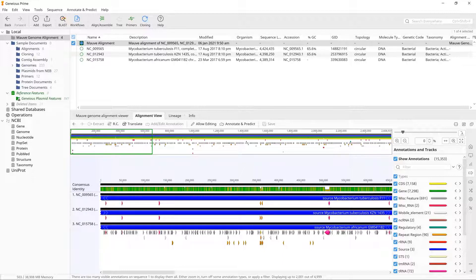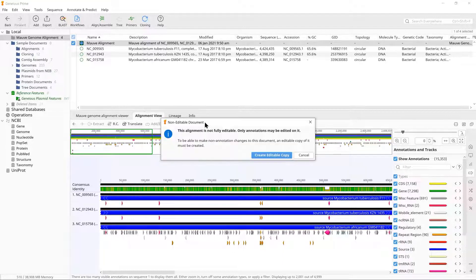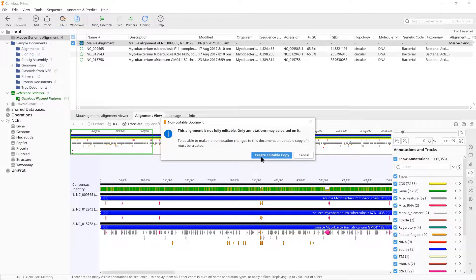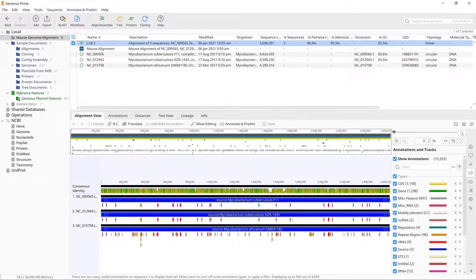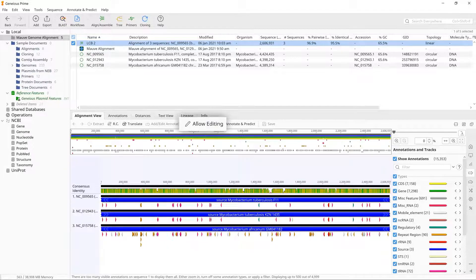However, only annotations can be edited in this viewer, not the sequence itself. If you wish to edit the sequence, you must create an editable copy, which will be a standard Genius alignment document. You will be prompted to do this if you click Allow Editing.